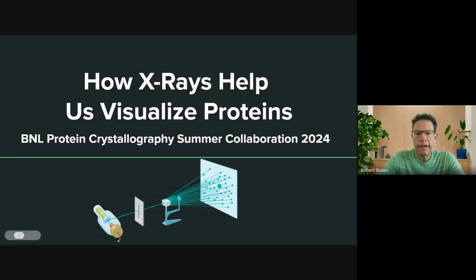So there's a crystal in there, and the X-rays hit that crystal, and then those X-rays, when they pass through that crystal, are diffracted onto this detector, and there's a dot pattern that forms, and that allows a computer to take that dot pattern and transform it into a three-dimensional structure. So the real key thing here is getting the X-rays.